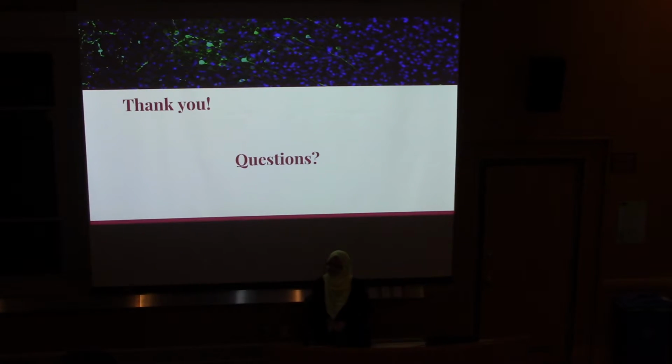So you have an issue placing the cannula in the correct spot. Do you have any plans for what you're going to do to improve the accuracy? I believe it's really trial and error, and really making sure that we follow the bregma locations is an important aspect of being accurate during these surgeries.